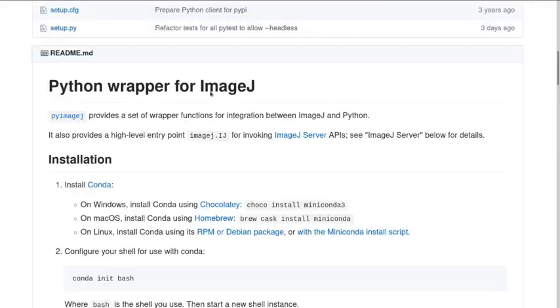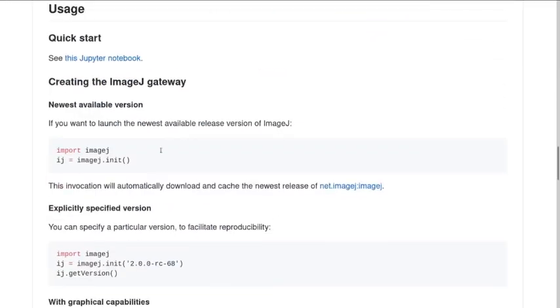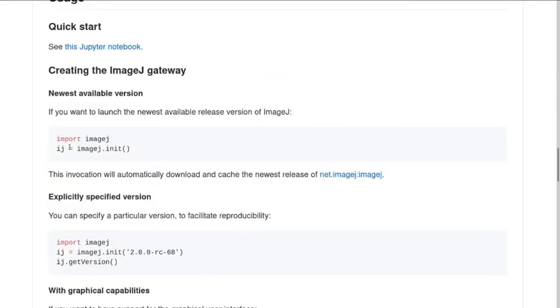And they've also more recently introduced a thing called the ImageJ server. And what the ImageJ server does is it's like ImageJ, but you can kind of send almost web commands to and fro from it to control the ImageJ. So, we will talk about that briefly, but primarily PyImageJ integrates between an ImageJ gateway, which is basically the same as if you double-click the Fiji icon and it opens an object, and it just interacts with it in a programmatic way.